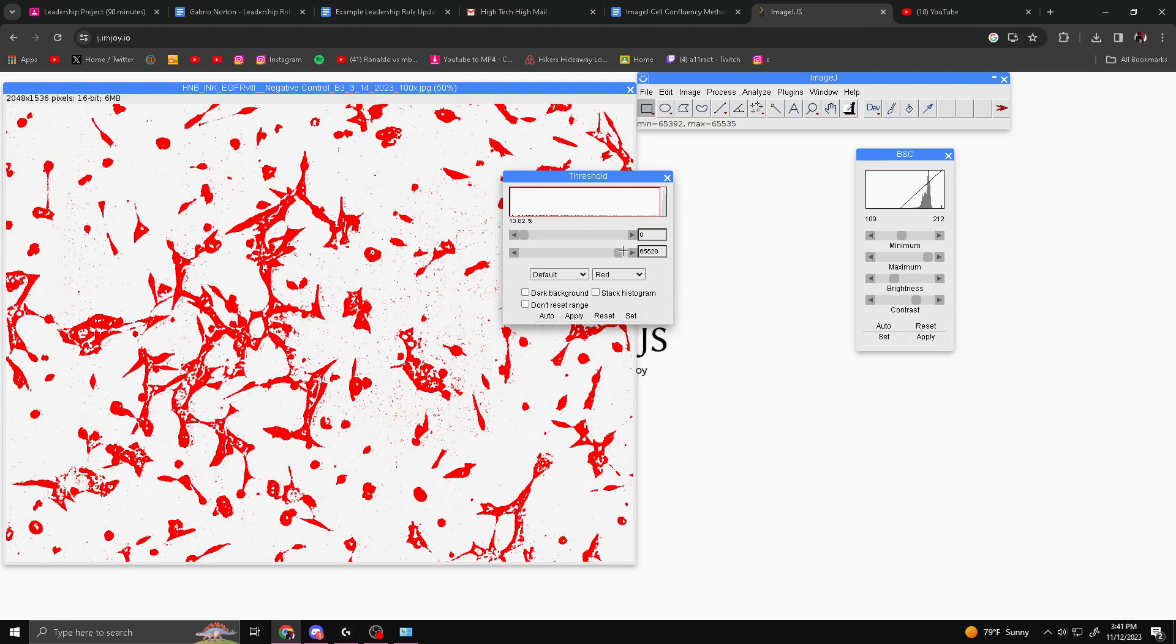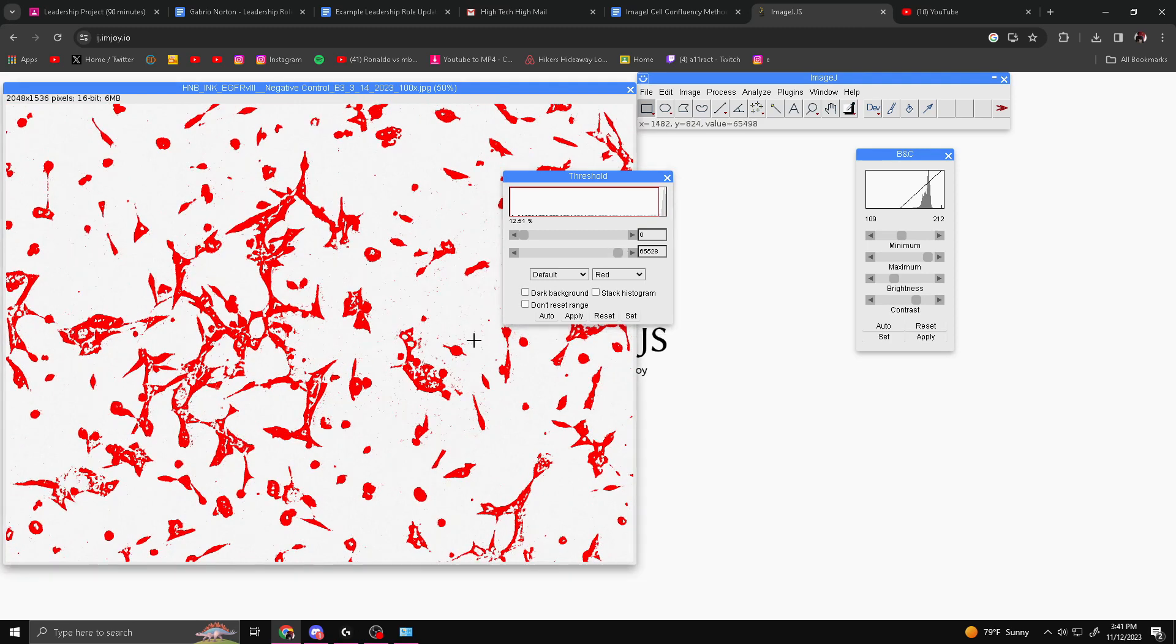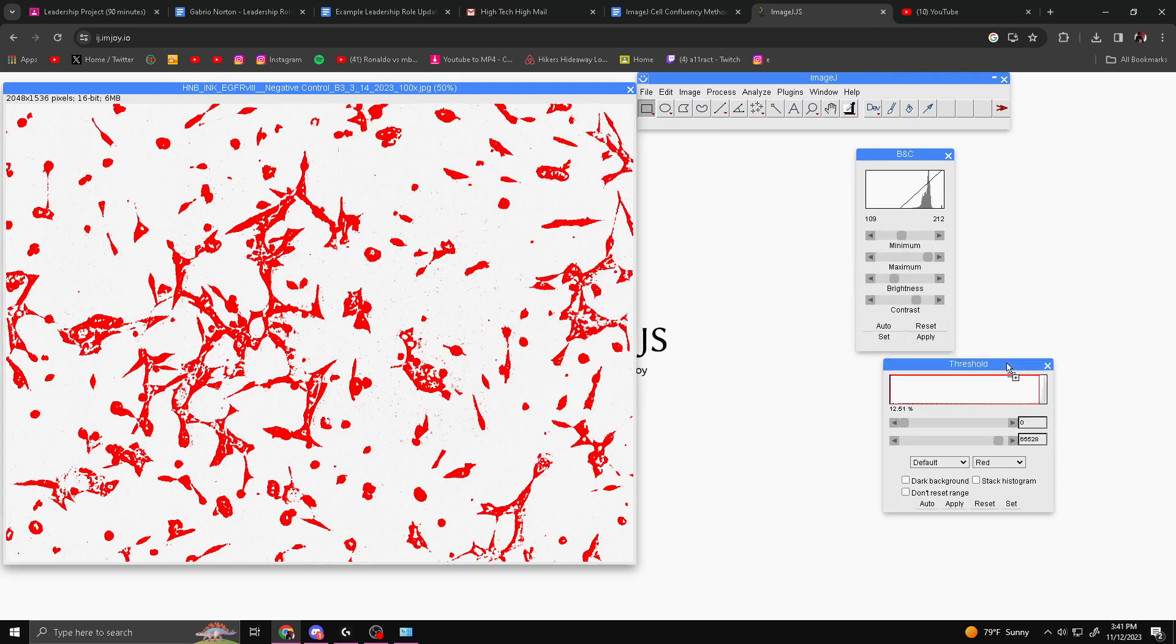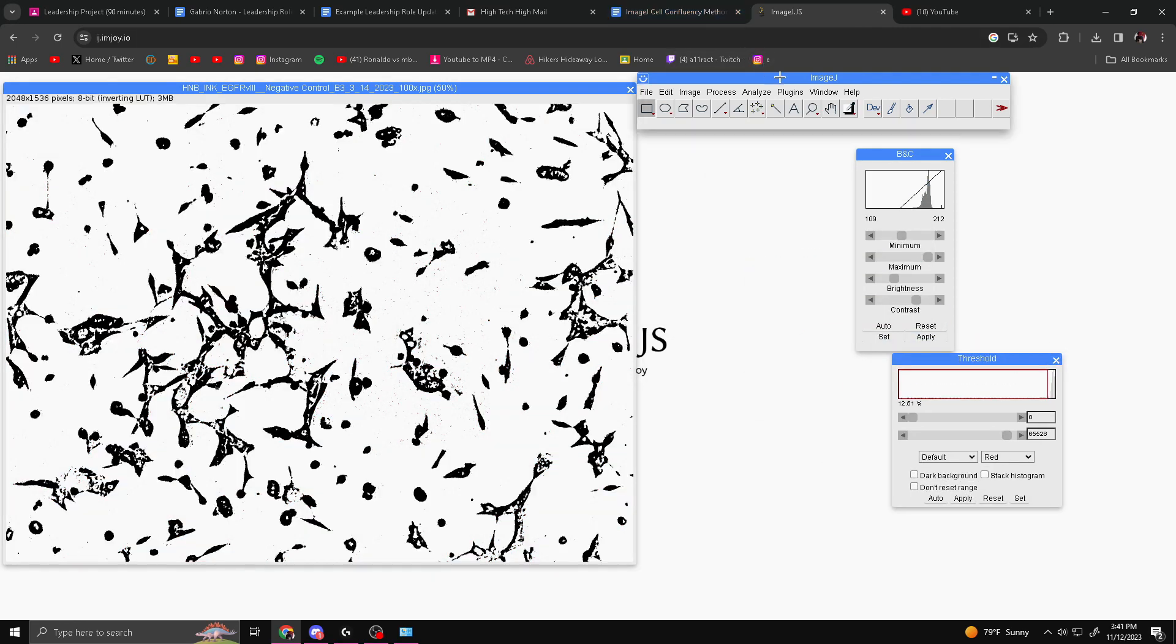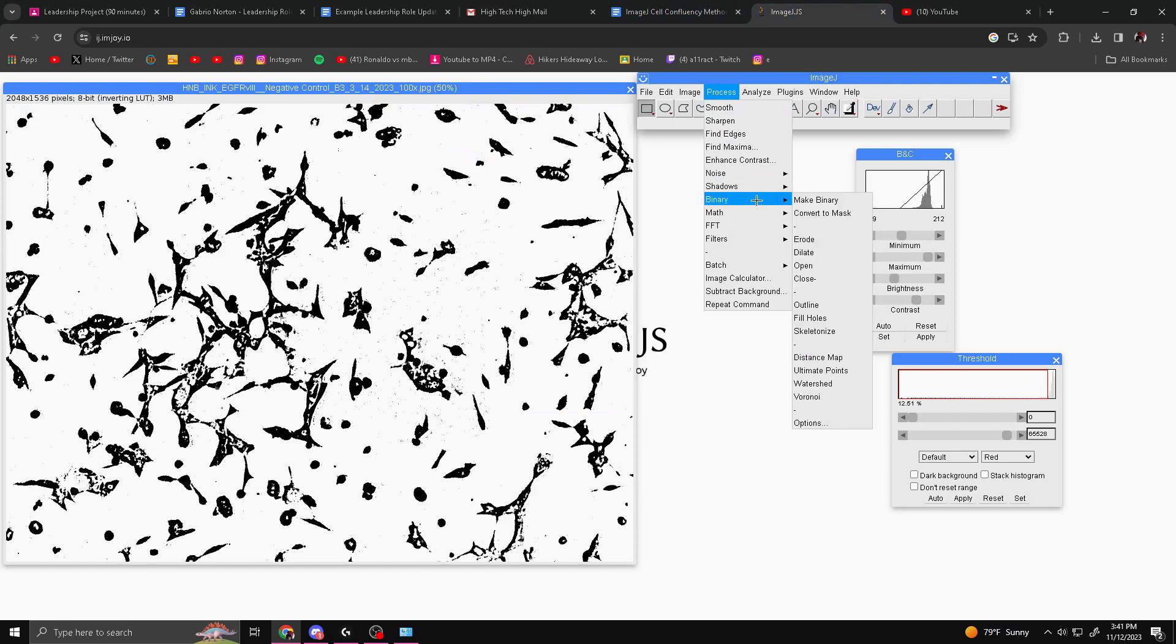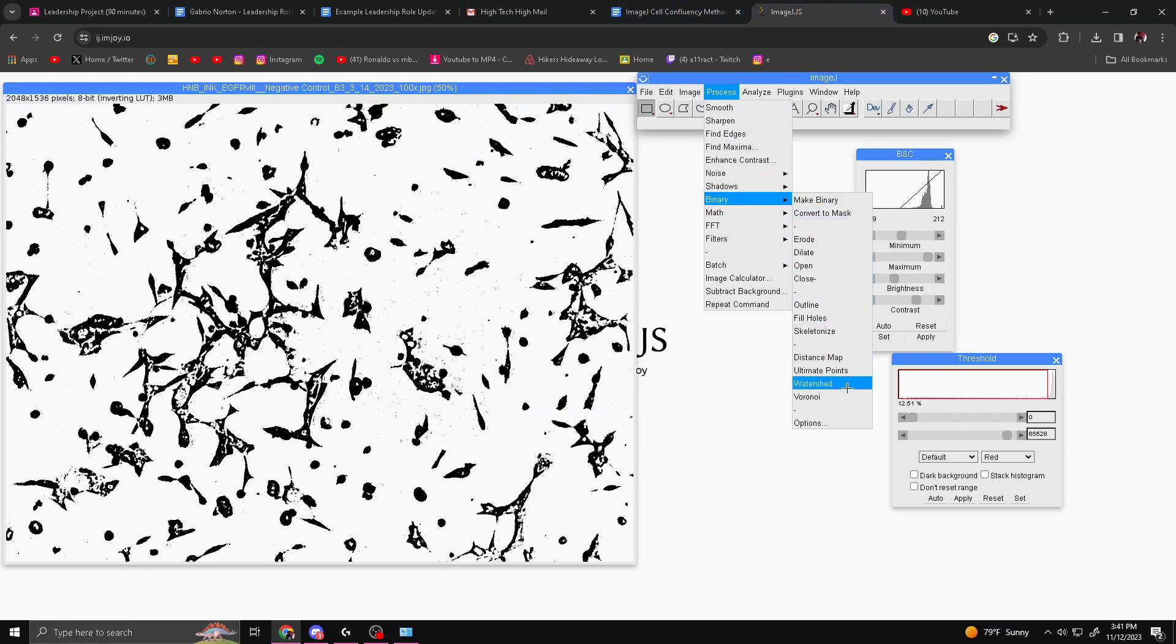Find something around there. If there's a little bit of cells coming up, it's okay. You just want to go somewhere around there. You want to hit Apply. Next, you're going to separate the image overlaps. You can do this by going to Process, Binary, and clicking Watershed.